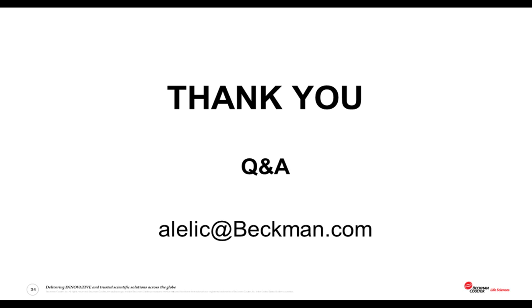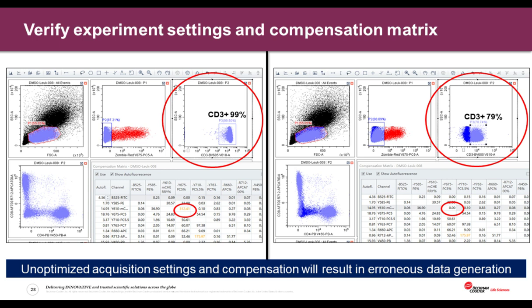So you should never use uncompensated data. And I'm really sorry if that was lost in my message. It wasn't what I was trying to say. You should always compensate your data, and the data that I was showing you in this slide here was actually compensated. Are they able to see my slides, or are the slides gone?